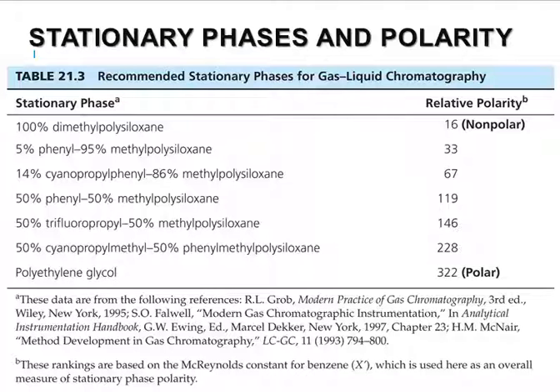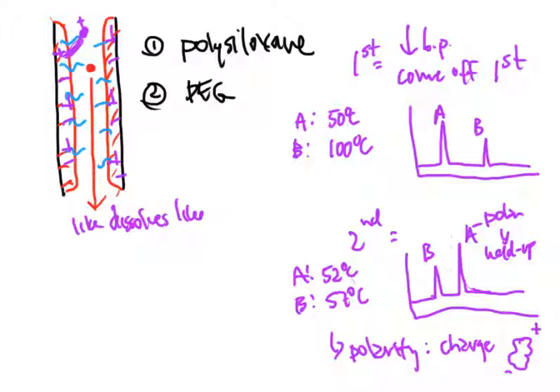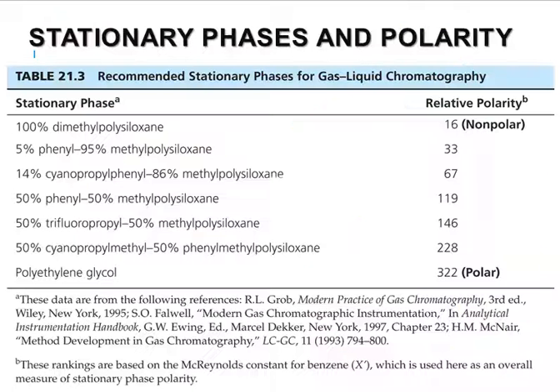Okay. Polyethylene glycols, these traditionally go by another name. In case you ever want to know, we call them PEG, but these things can also be called Carbowax, not chrome absorb, but Carbowax. That's another industry name that we can use to describe those stationary phases.